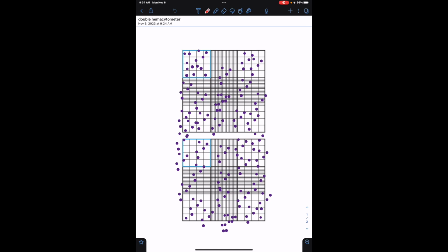This one, we're going to focus on white blood cells. So here's our WBCs right here. We're going to start on, this will be side 1 and this will be side 2, or A or B, however you'd like to refer to it. We're going to count these in our first square here. I guess if I used a highlighter it'd be a bigger box. Oh, well, that's not helpful.